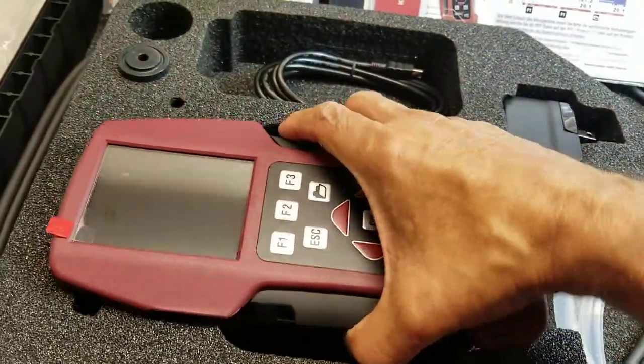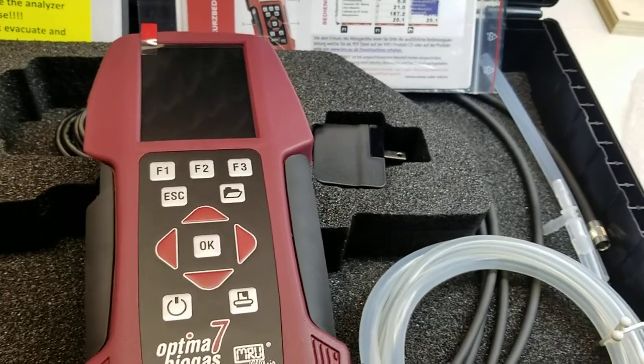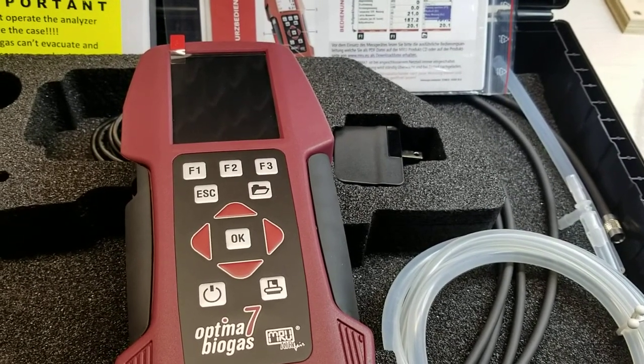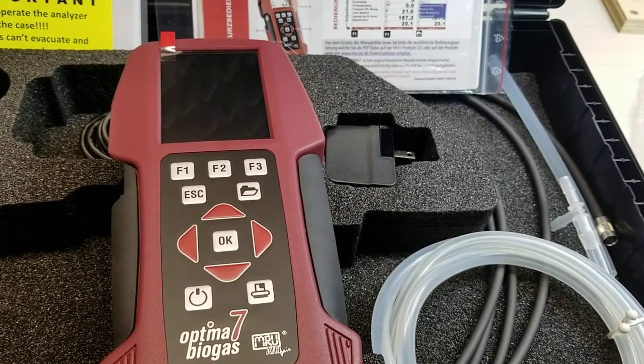This instrument comes with an O2 long-life sensor 0–25%, CH4 NDIR 0–100%, CO2 NDIR, H2S 2000 ppm, and biogas pressure measurement of plus or minus 300 millibar.